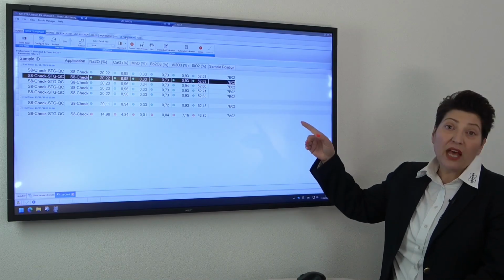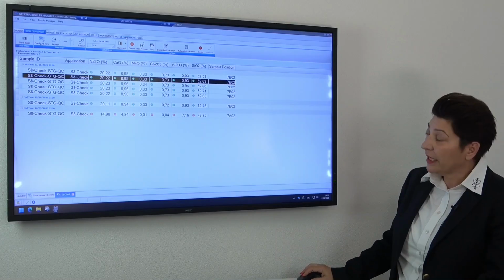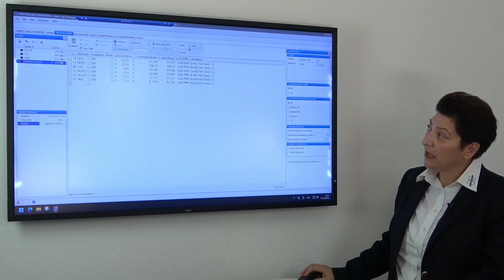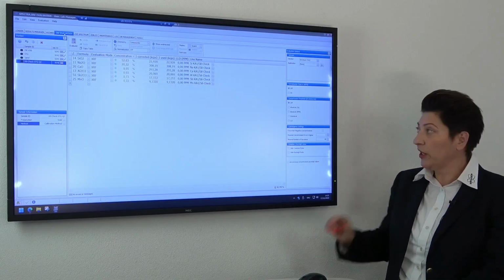If I want to have a closer look at this measurement or any other measurement like the standardless method, you can start the evaluation from this button here, or you can enter automatically here with this XRF evaluation tab.